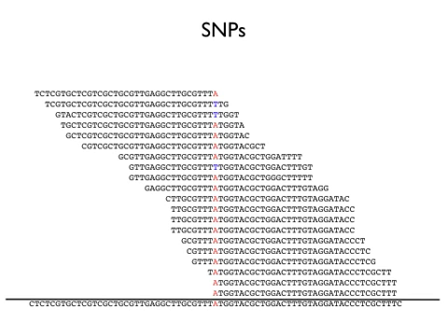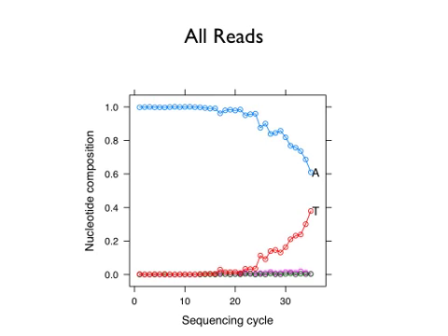So notice that for cases where the supposed SNP is in the beginning of the read, we never see a T. Right? So you don't get to see a T up until towards the end, and then once we're at the end, we start seeing more T's. So that's just 20 bases, but we can do this. By the way, this is now real data. This is not fake. We can do this with all the reads that map to this location. This was a small little genome, so we could do a lot of coverage.